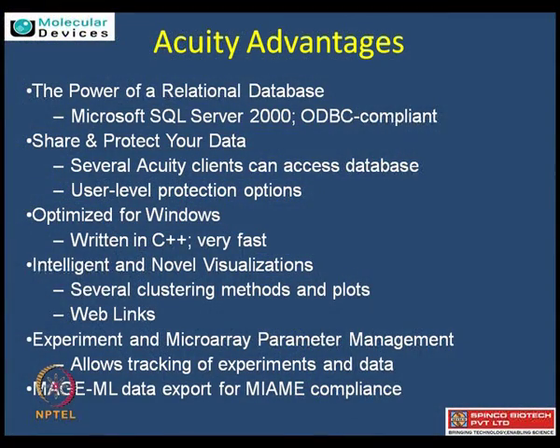So many scientists want to give different parameters and allow the software to sort or understand the biology based on that, which we call parameter files. Actually this is MDT files for us, which you can import and manage all your parameters within the experiment so that you group them and do the analysis accordingly.